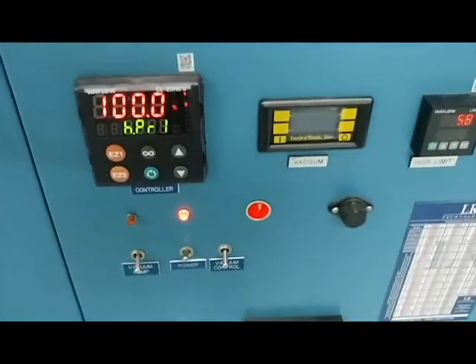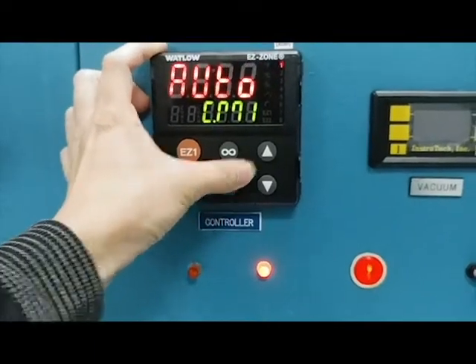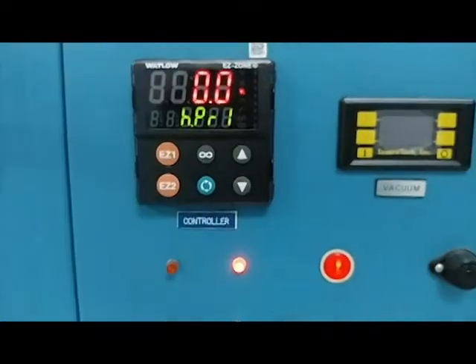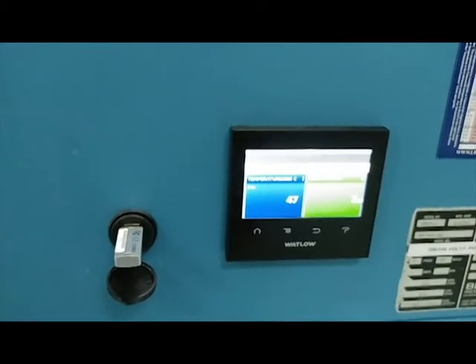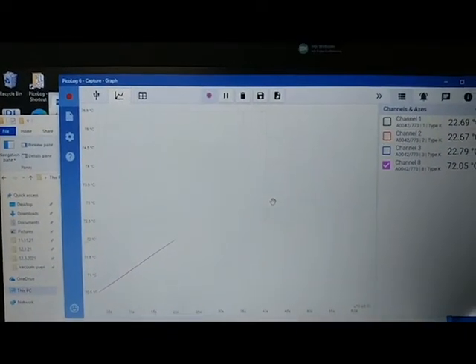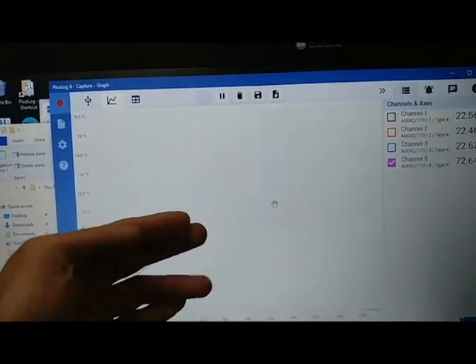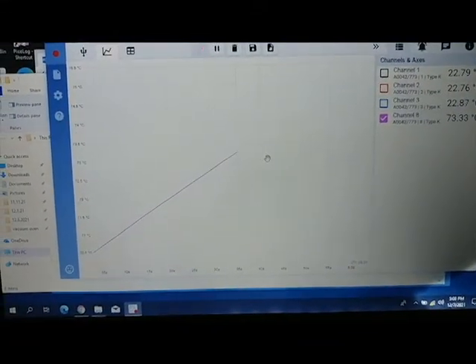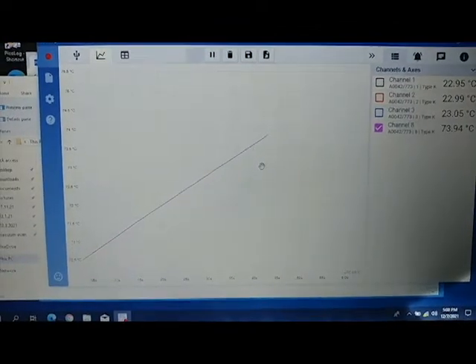Right now heat is at 100% at 45 degrees. We're going to turn this off and let it coast. So you see it now goes to 0 and we will see the temperature will keep rising. This will prevent it from overshooting. So we try to zoom fit, so this is a 1 minute increment. Then you can see now it's climbing. When it levels off to near horizontal, then we'll check how close we are to the set point. We don't want it to be climbing at a steep rate if it's already near the set point, or it will overshoot.